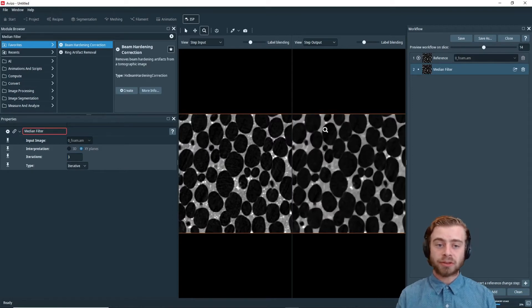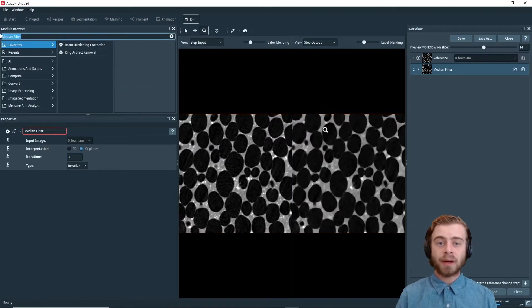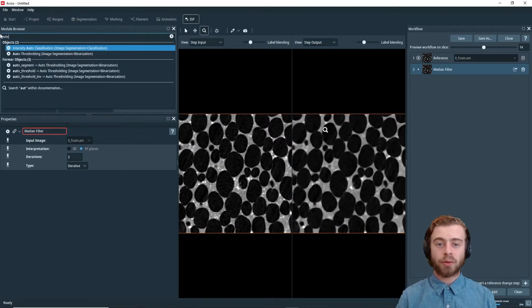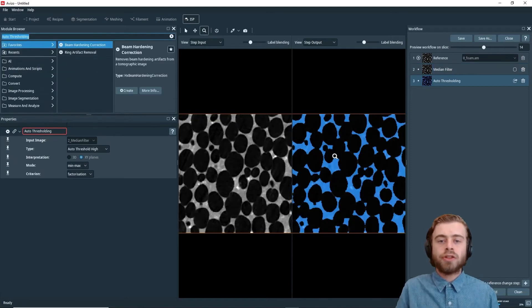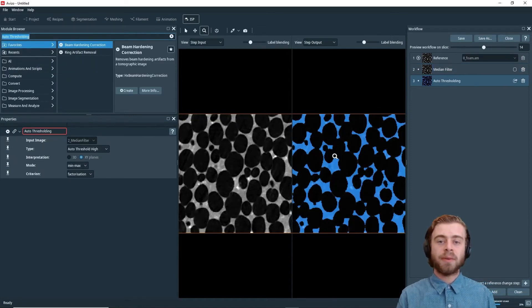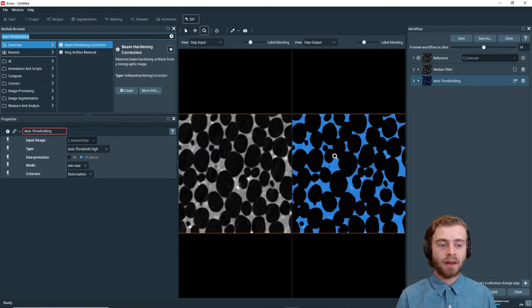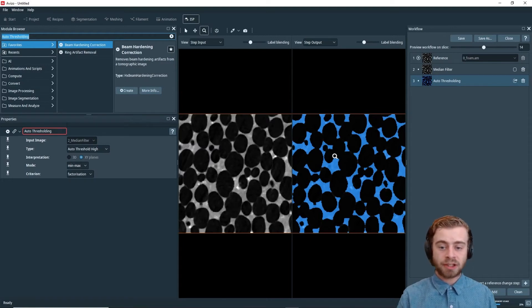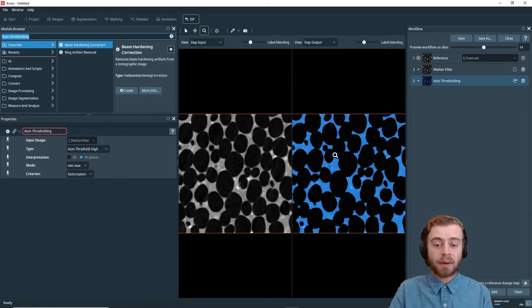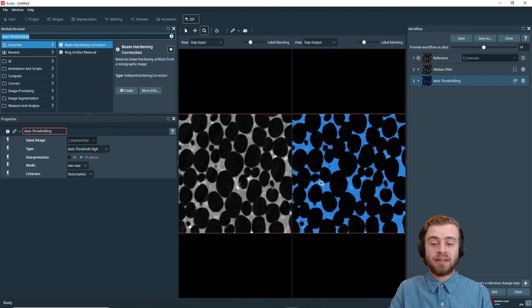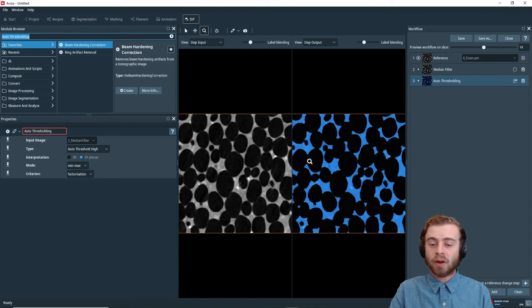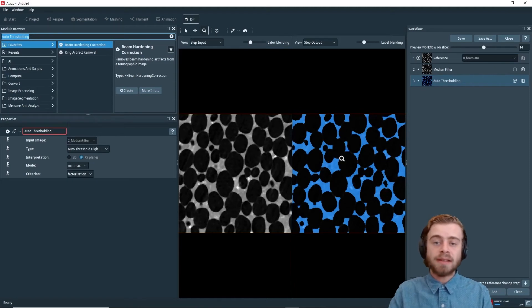So now that we've applied the median filter, I next want to apply an auto thresholding filter. The goal of this thresholding is I only want to select the material and not the pores in this dataset. So with this auto thresholding operation, we can see how now only the material is selected, and all the pores are not selected.